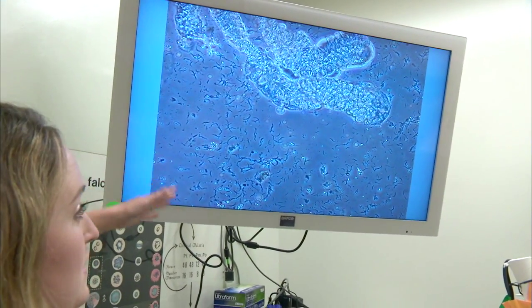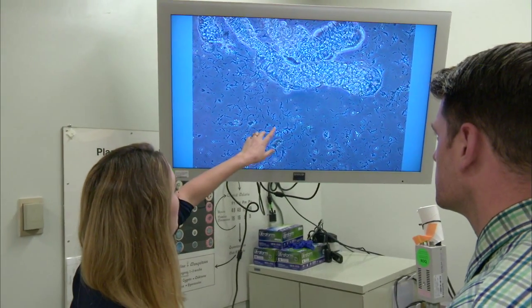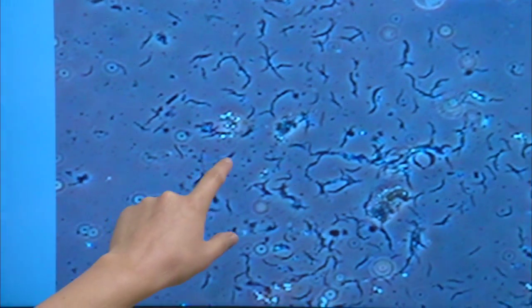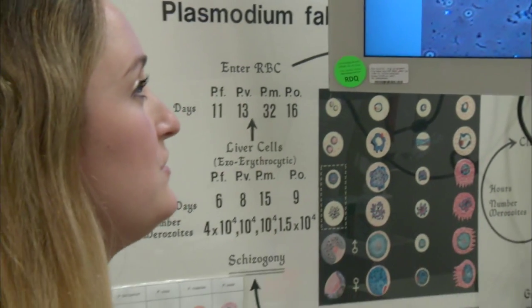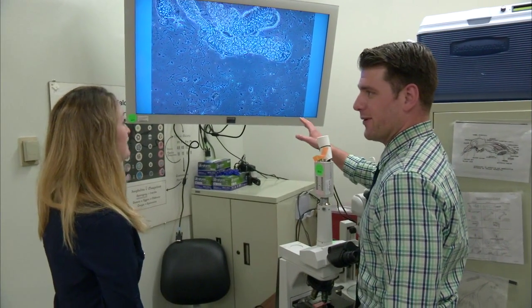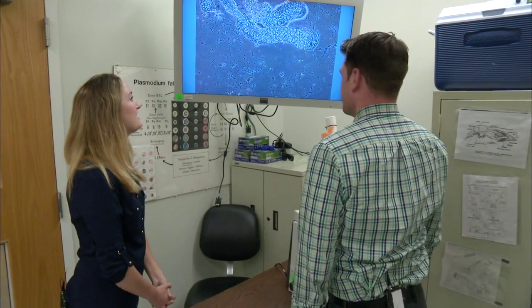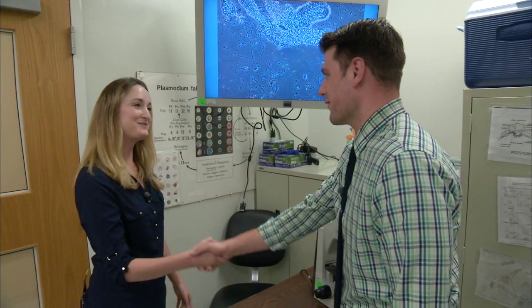This is what you would see if the mosquitoes were infected — these little tiny sporozoite parasites, the infective stage, and they kind of look like tiny eyelashes. We have a pretty good number right here on the screen. If this was a real challenge, we would be happy with what we see. Just to be clear, this is not my sample — it's a different sample. I have none of these tiny eyelash things. No eyelashes. Well, that is good to hear, and I appreciate you having me out.